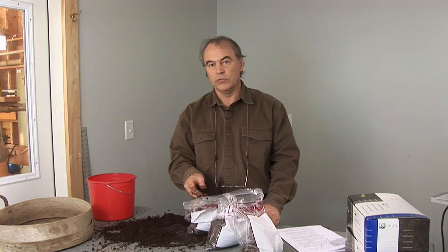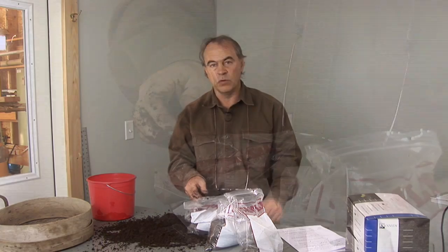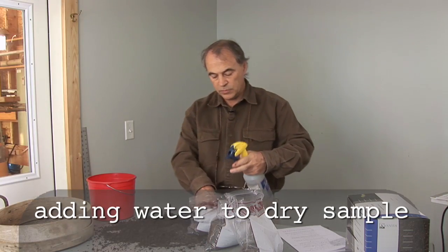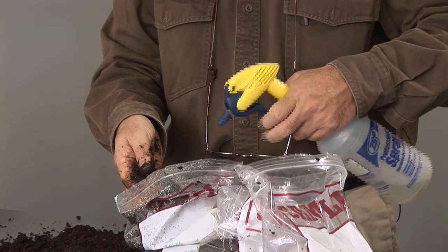If the sample is so dry that it crumbles, you're going to have to add water to it before performing the test. Adding water to a sample is a simple matter of using a spray bottle to moisten the material until it's at the indicated optimal moisture.